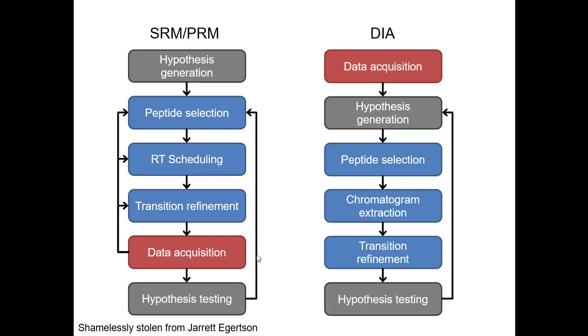You can do this at your computer instead of having to reacquire this data over and over and over again for every new hypothesis. I think this is the strongest beauty of doing a DIA method, and the biggest reason why we would want to. It's much less about being able to measure the entire proteome. It's about having the ability to not have to think about what you're doing while you're doing it quite as much. You can collect some data, you can experiment and play with it and iterate very rapidly on the data file instead of with the instrument itself.